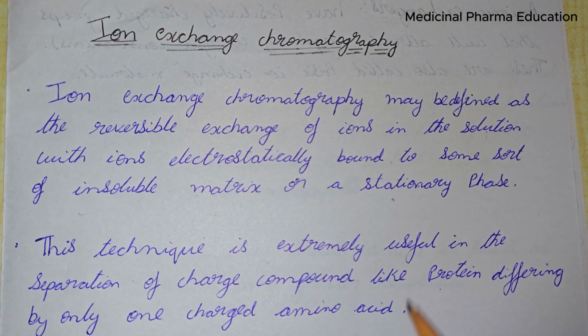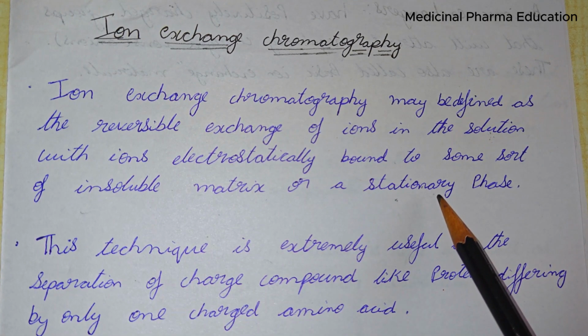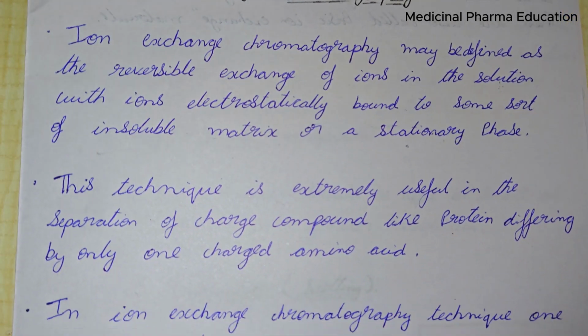That's the exchange process. Or if negative ions are present here and positive ions are present, due to their attractive nature or due to their displacement, they will be replaced. They'll be exchanged. There'll be two processes: cationic exchange and anionic exchange. There'll be an exchange of cations or anions based upon the solution.